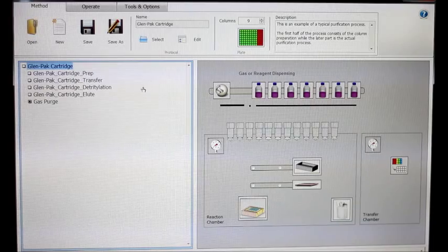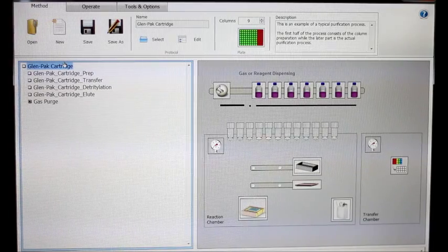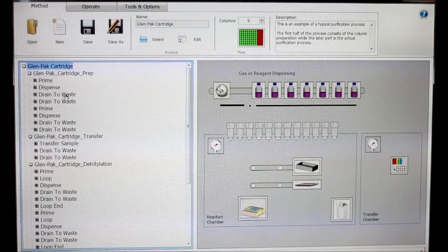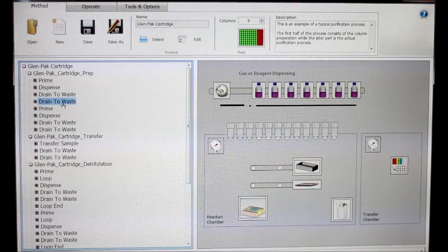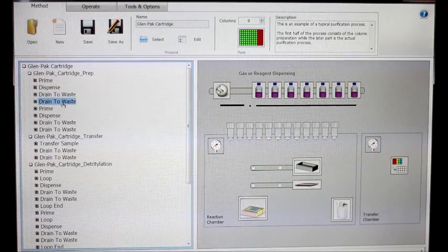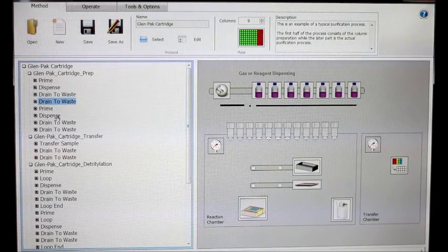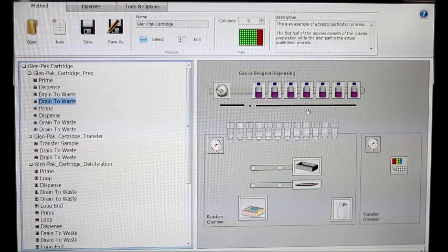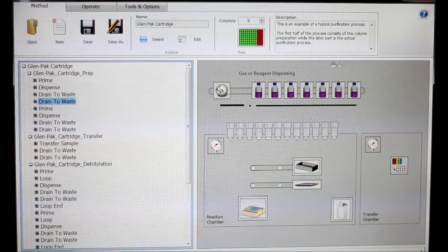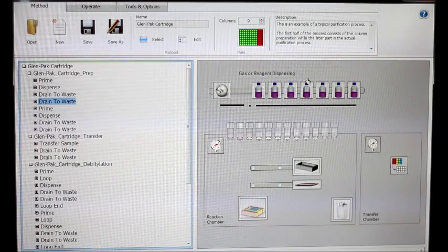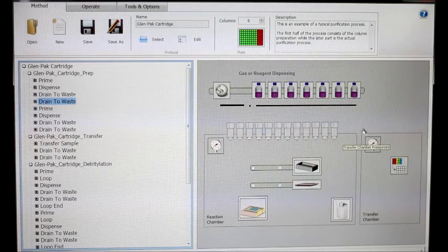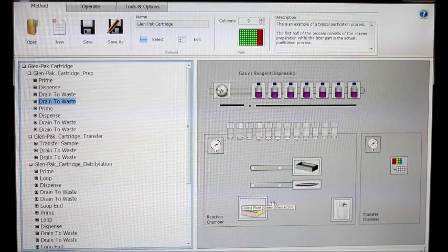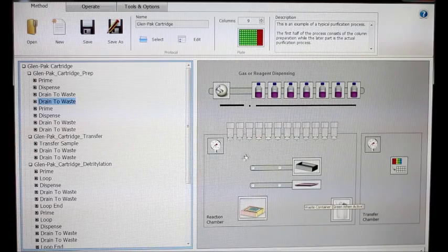The left-hand side of the screen is the extended protocol view where you can see a step-by-step view of the process and which step it's on. During the process, the instrument will actually show you which step it's on by highlighting and moving on each step. The right-hand side of the screen is a graphic interface where you can actually see which reagent it's dispensing at a given time along with which valve is actuated at a given time. The bottom half of the screen shows where plates are in the reaction chamber at any given point during synthesis.